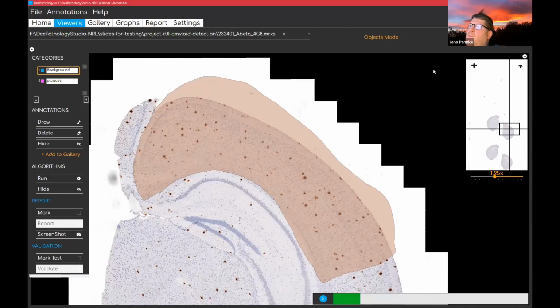When you run the model, you have to check in between. So it can be that it is overlearning and it's getting worse. Depending on the detection you do, you get an experience after a certain time whether it's good enough or not. So this is something that is a bit complicated for machine learning to stop itself.